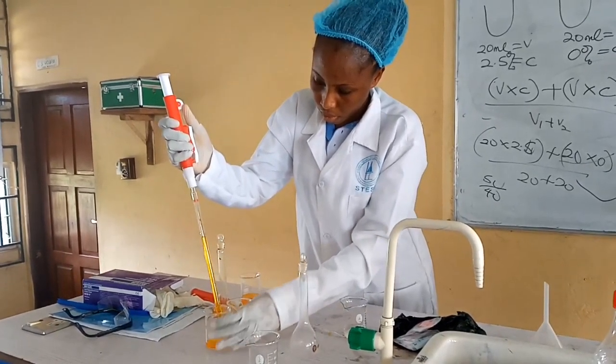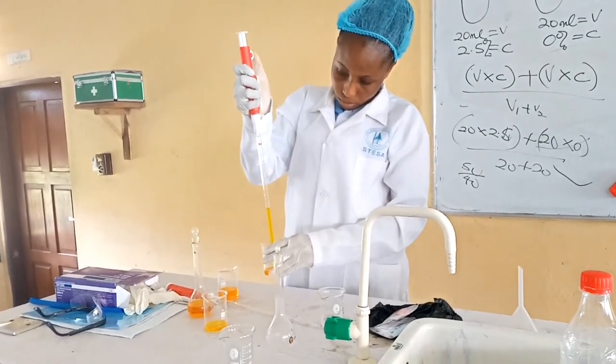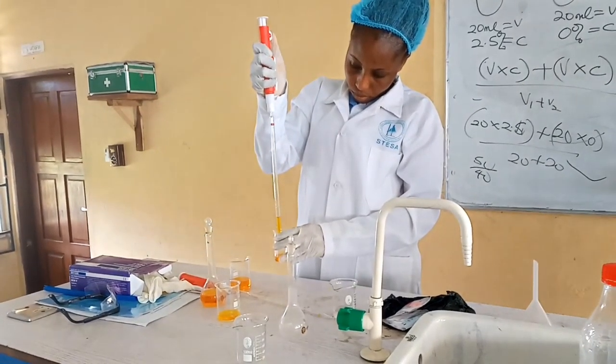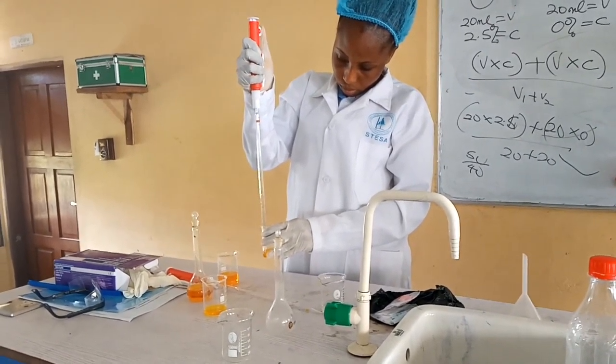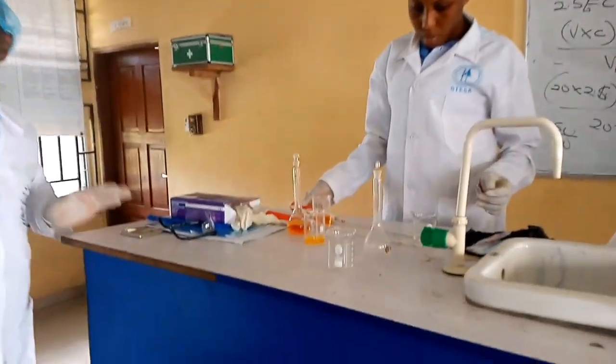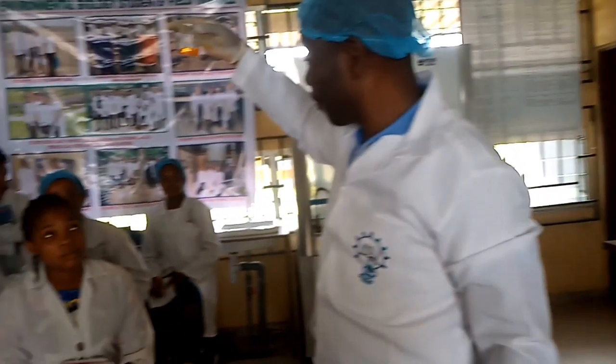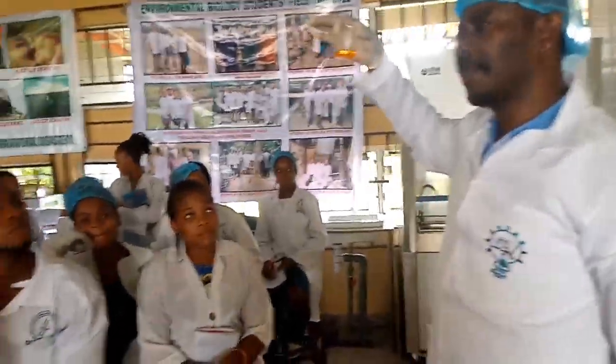You have finished taking that thing. Remove your hand so it doesn't drop. Once you have taken it, you relax your body, unless you are vibrating too much. So now I'd like to give 1,000 naira to someone that will tell me the concentration of this. 6.25. Anybody want to try again?